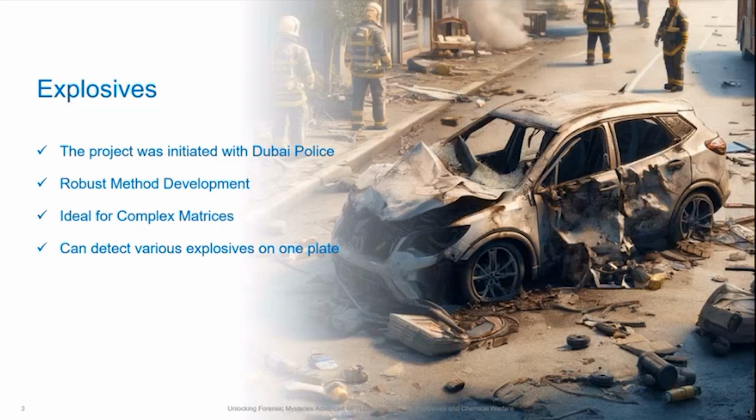So while doing the analysis, you use one plate. Tin will explain you later the details of this application. So please, Tin, I will hand over. She shall do a nice presentation and explain you all the advantages of HPTLC with explosives.